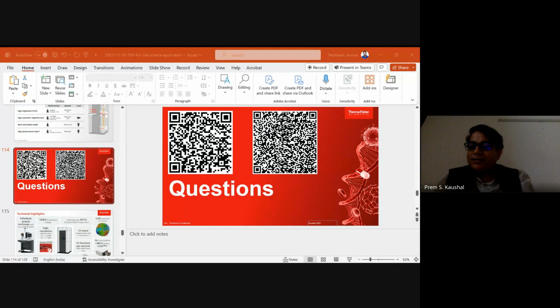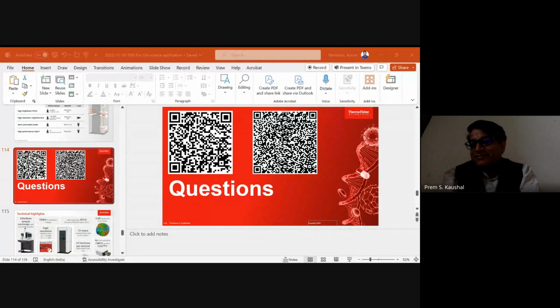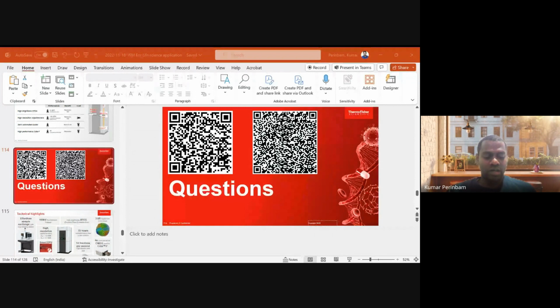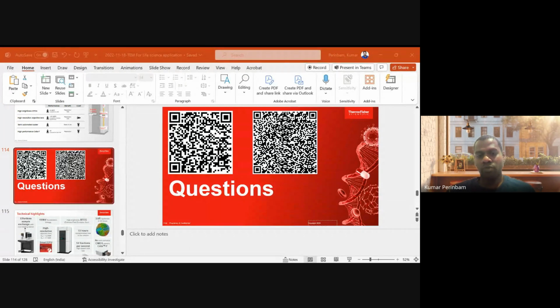Okay. Second is, what is coming next, what can we expect in the next 3 years from Thermo, hardware, software? One recent thing that I've been following from Thermo's side is they're working on a laser phase plate. There's a concept called phase plate development happening. They're investing to increase the contrast of the sample pretty well. That's what they're focusing on.